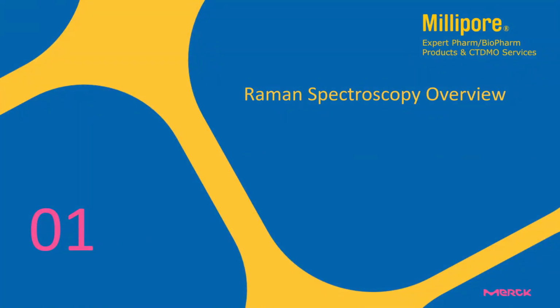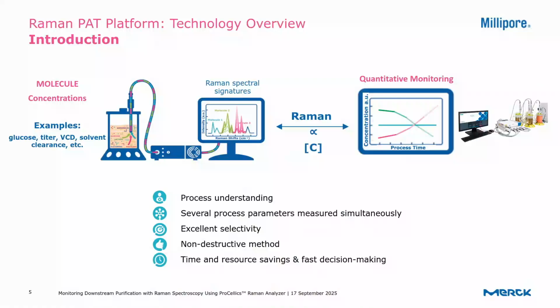To provide an overview on Raman spectroscopy, we see it as a valuable PAT tool for measuring a variety of different components in line. You can see it here connected to a bioreactor or a tank, being able to measure components like metabolites, your protein titer, your cell densities, and your solvent levels in line, measuring several process parameters simultaneously.